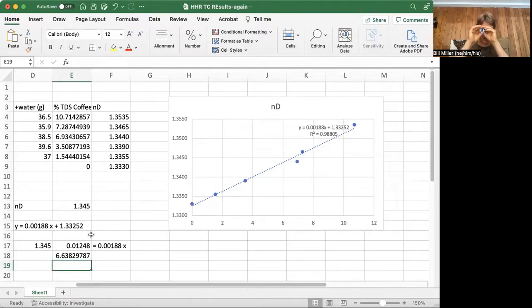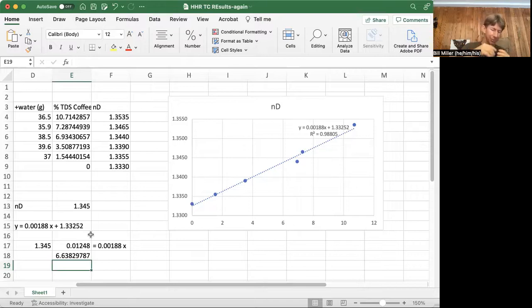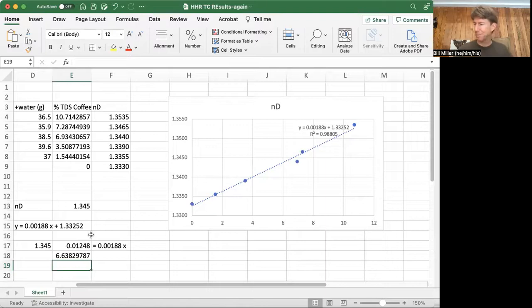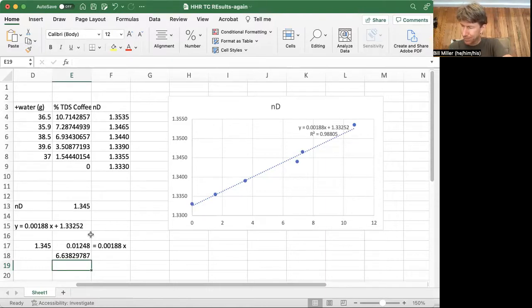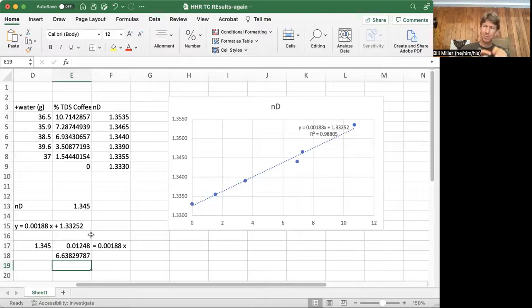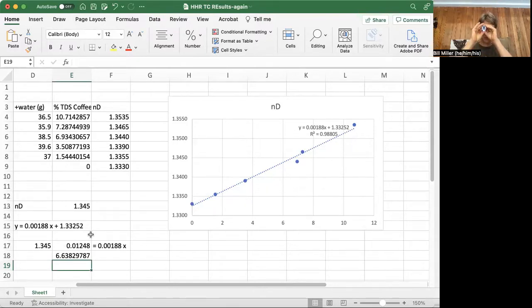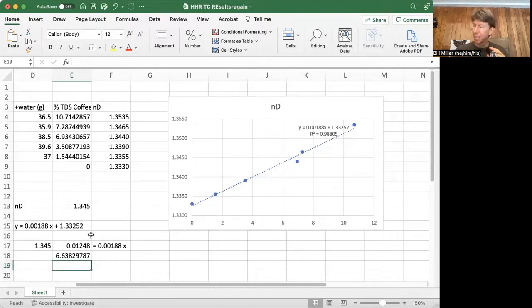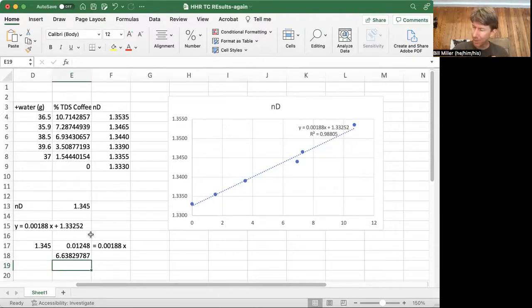Yeah, 1.33345. 1.33345. Let me write that down. Is that possible? 3.333, 334, 3345. There we go.